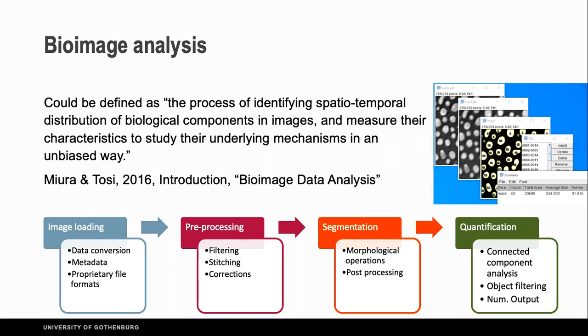All right. So here on the top, you see a little bit of that example. You see raw data, filtered data, segmented data, then a table of all the objects, and then finally a little number that describes, for example, the area of the cells.